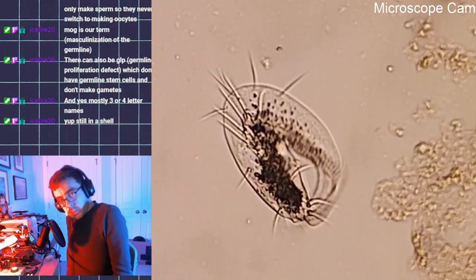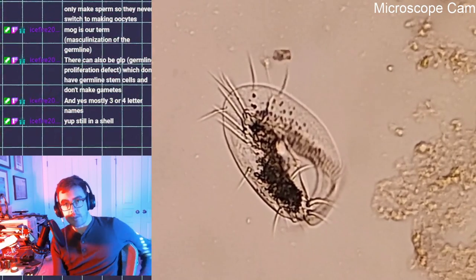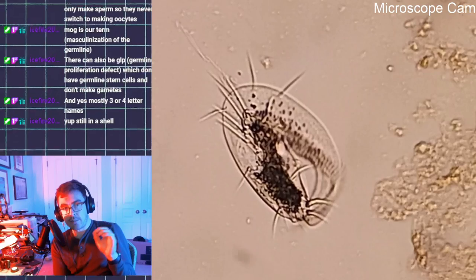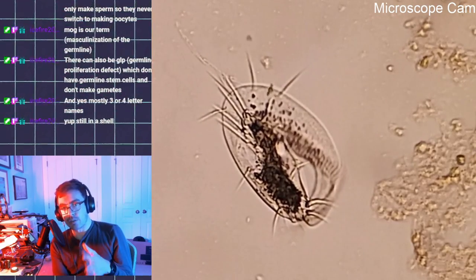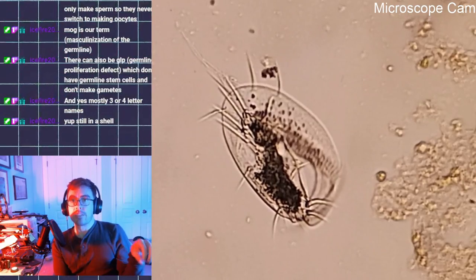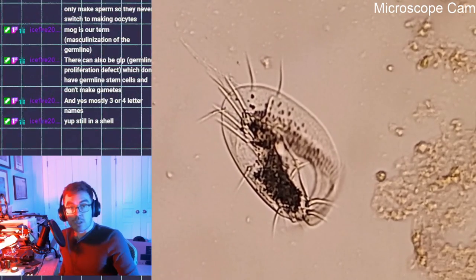I forget who it was, but someone had a suggestion of trying to figure out how we can get some food coloring or something in this. And I was thinking it might be a job for something that's 3D printed. Try and set up one of these in a channel between two wells, let it sit there and start filtering like this. And then in one of the wells, add the blue dye and maybe that would help direct it all. And we could watch the speed of this filtering. I feel like that might... It's worth a try.